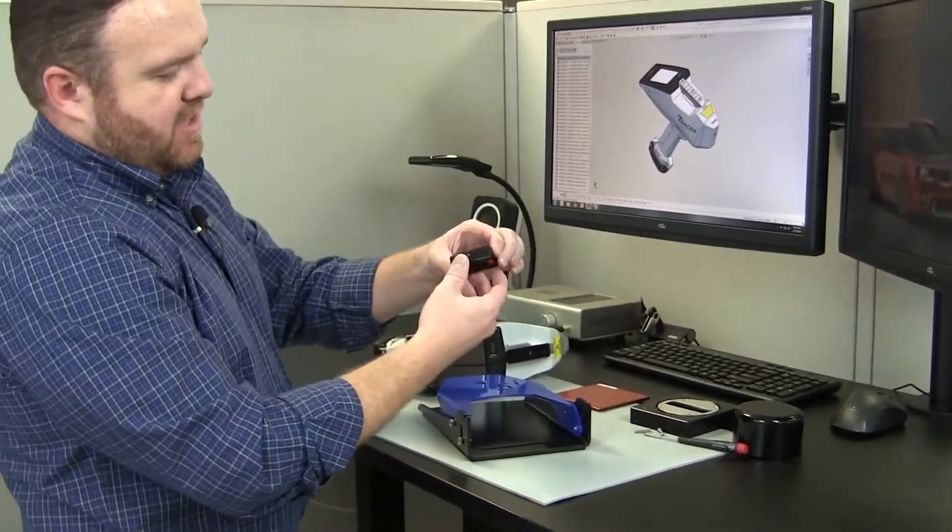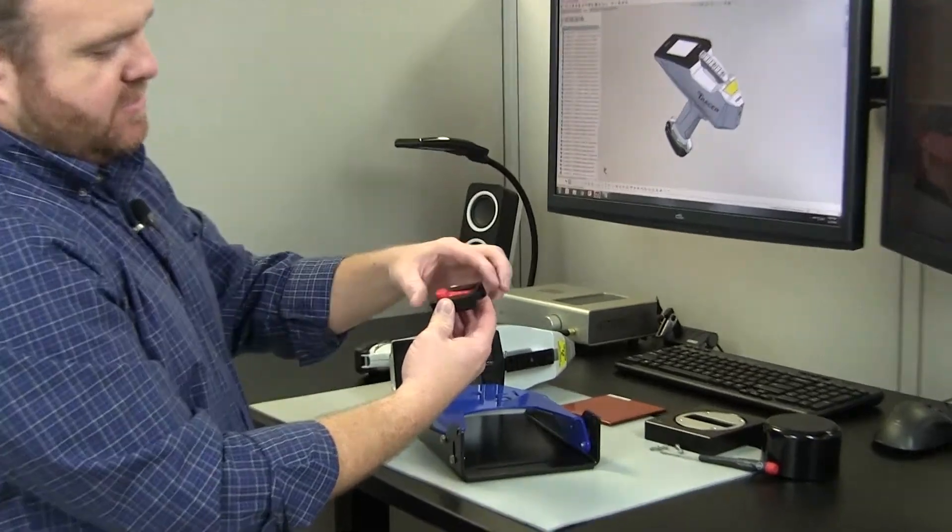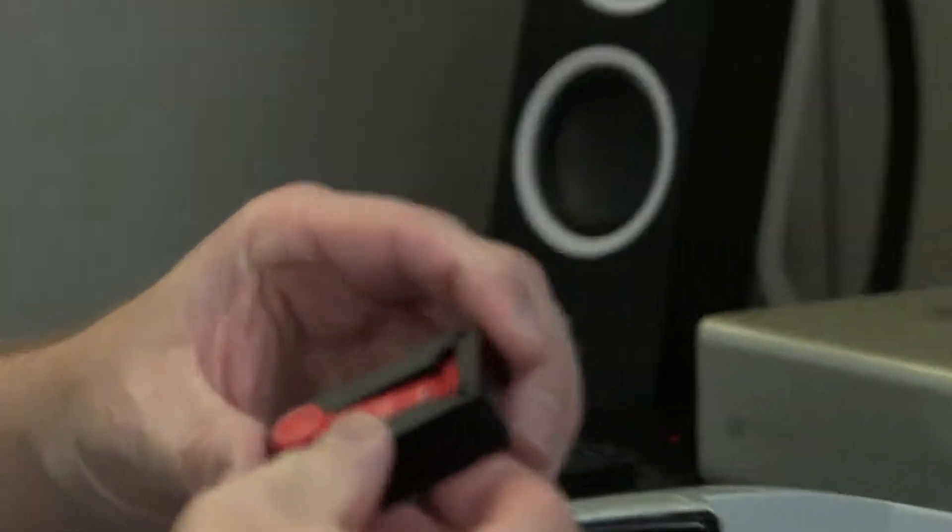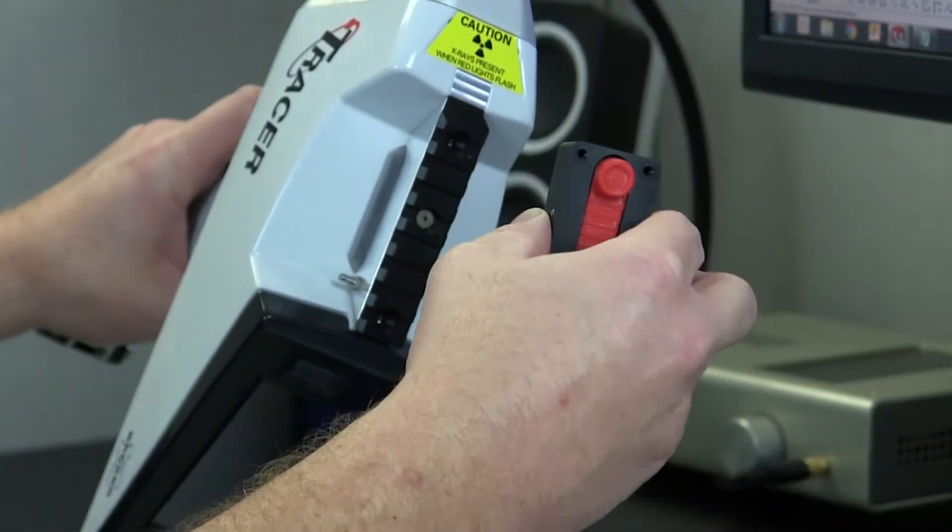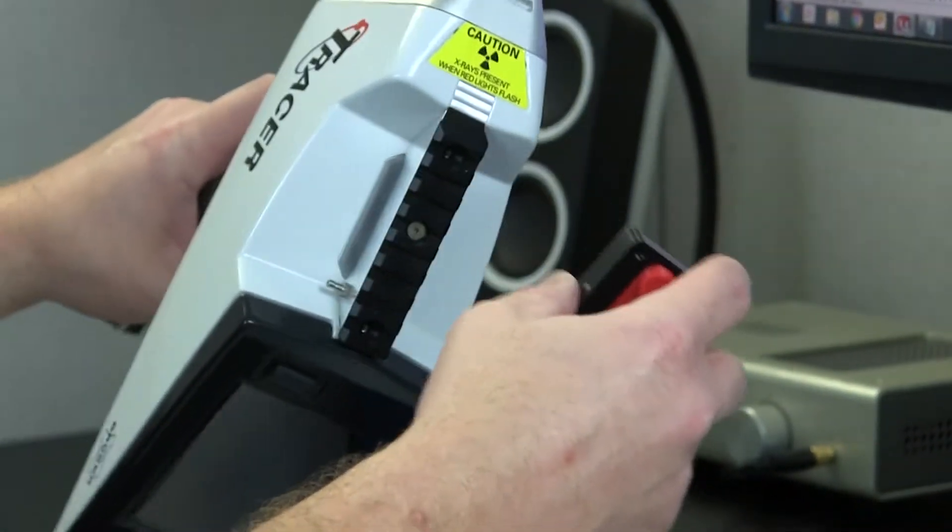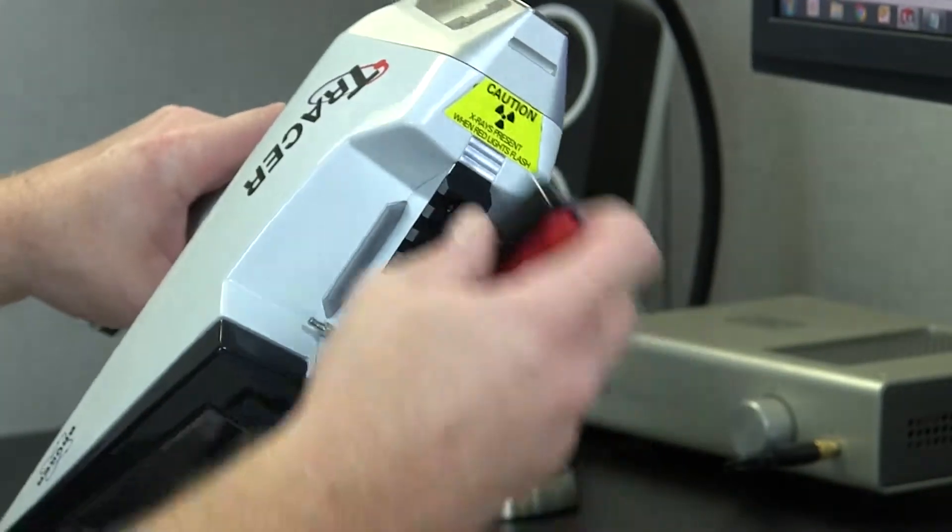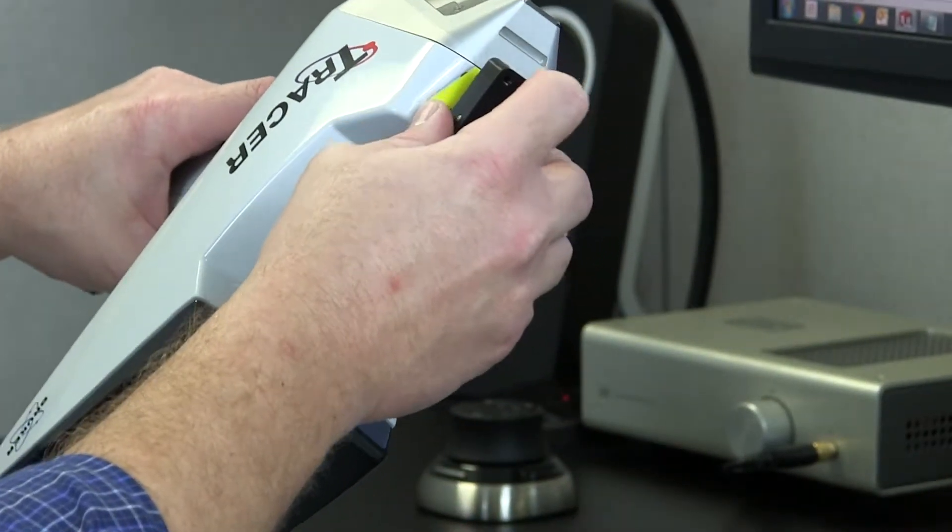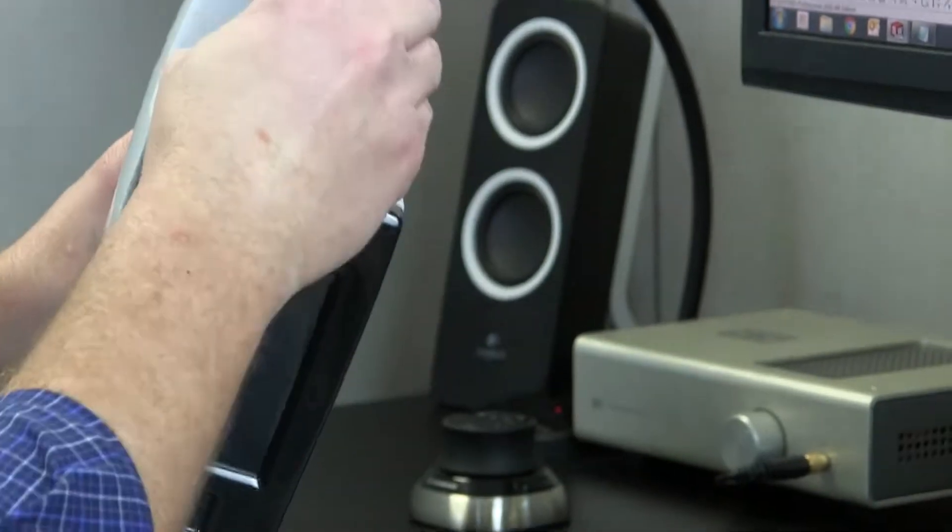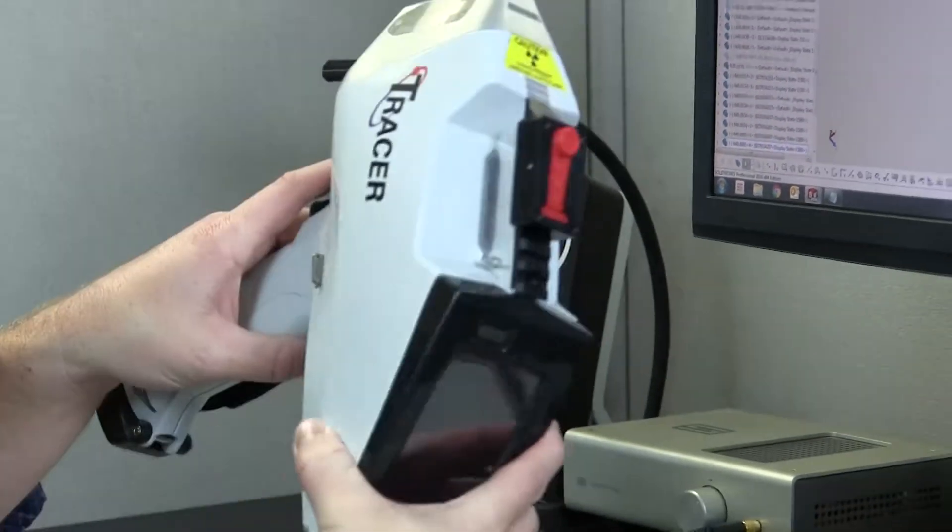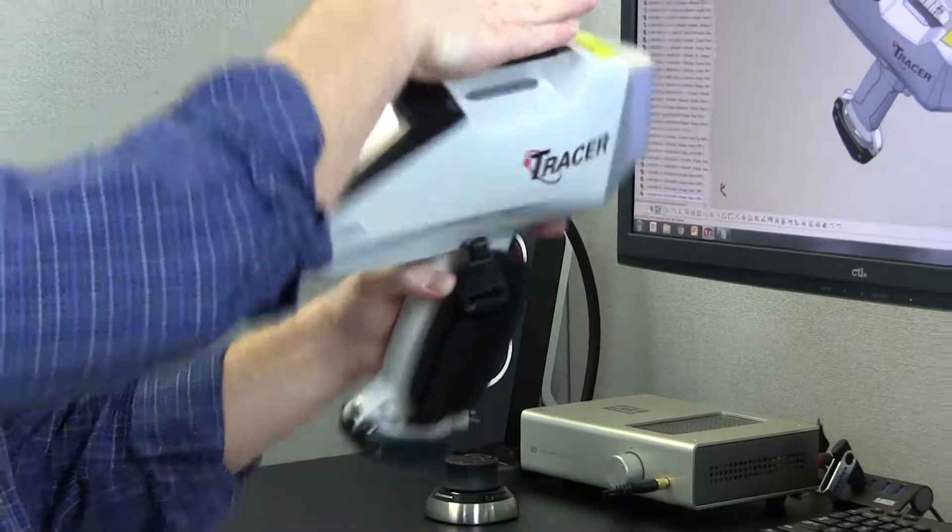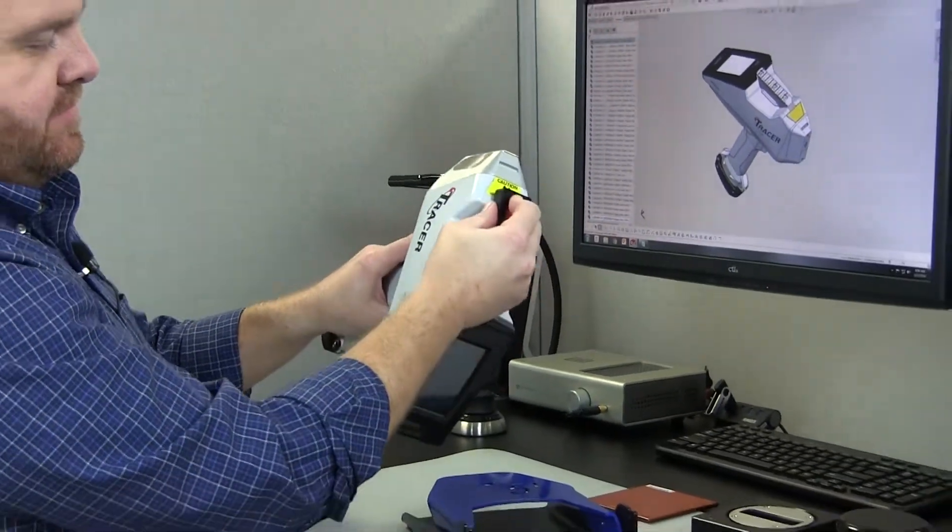This block has 6-32 tapped holes, and there are some screws that come with it. You can use your own if you need a longer one depending on what you're going to mount this to. You just need to leave access for the button. Basically, if you mounted this to your own rail system or needed to have the instrument mounted somewhere that you use a lot for your own application, it just slides on and then you can use it wherever you need it to be mounted in different orientations.